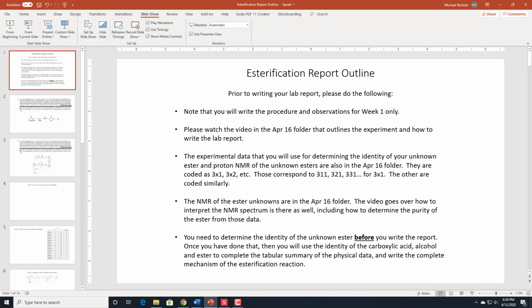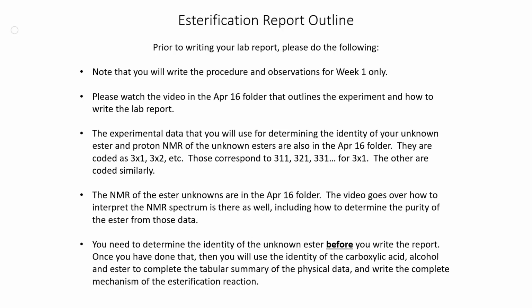So going back to the PowerPoint and going back into the slideshow, prior to writing the lab report, I would like you to do the following. Number one, you're going to write the procedures and observations for the only week that we did, which was to do the reflux. Then secondly, you're going to watch this video, which hopefully you're doing now, and it'll outline the procedure and talk about the lab report.